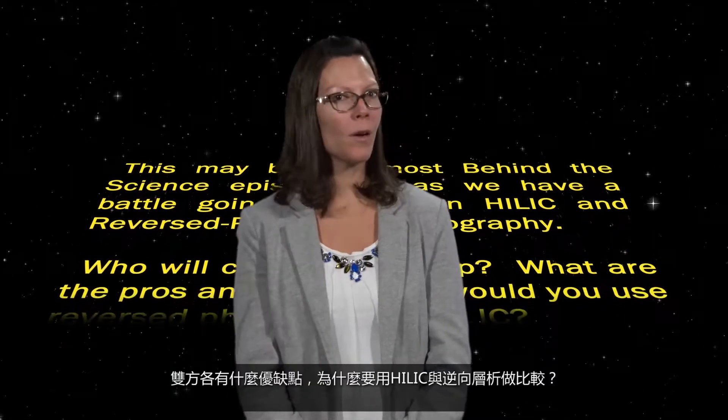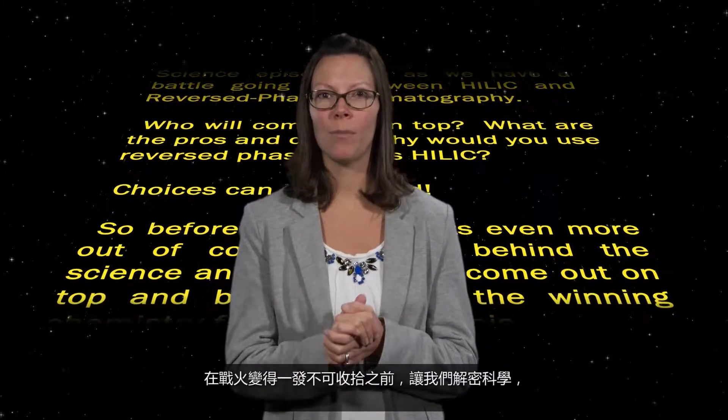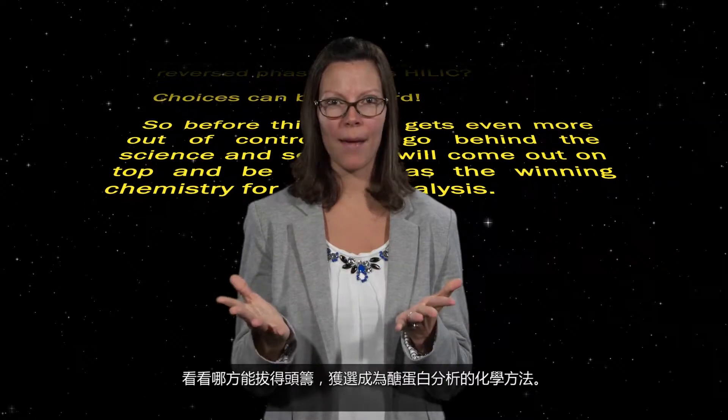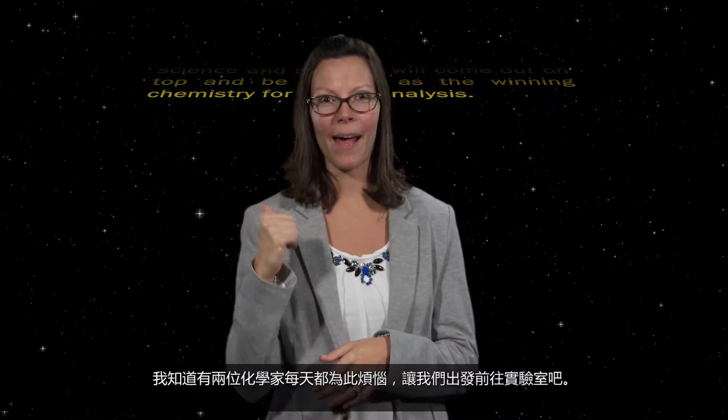Who will come out on top? What are the pros and cons? And why would you use reverse-phase versus HILIC? Choices can be so hard. So before this battle gets even more out of control, let's go Behind the Science and see who will come out on top and be chosen as the winning chemistry for glycan analysis. I know two scientists who have this battle on a daily basis, so let's head to the lab.